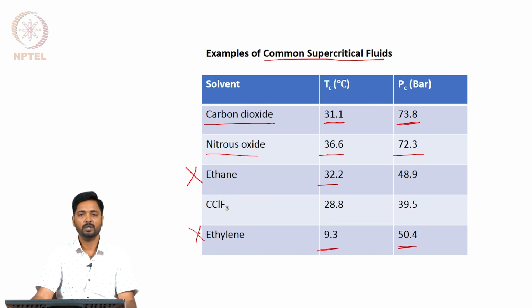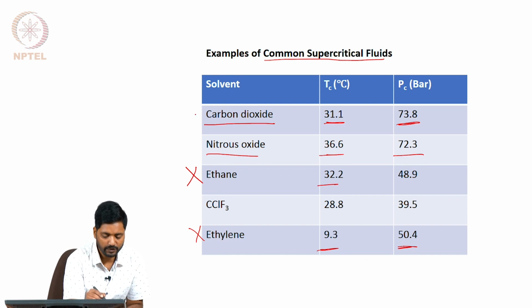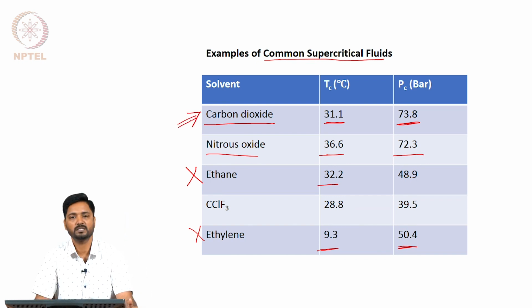undertaken. So, usually and most often the gas that is the most appropriate for use in supercritical fluid applications is the carbon dioxide gas. Now, this gas obviously is inherently inert to a decent extent and also has the appropriate temperatures and pressures at which it will undergo a supercritical phase transition.